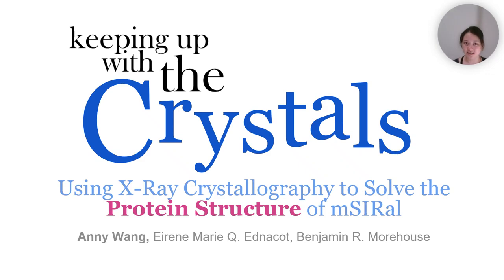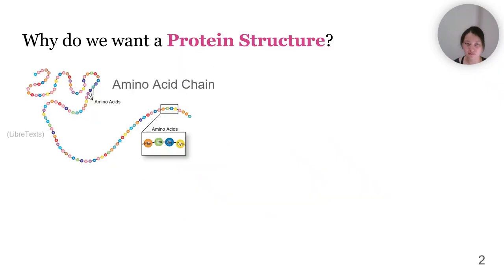Hi, my name is Annie, and you're watching Keeping Up with the Crystals, using X-ray crystallography to solve for the protein structure of mSIRal. The first question that might come to mind is, what exactly is a protein structure? And secondly, why would we want one?